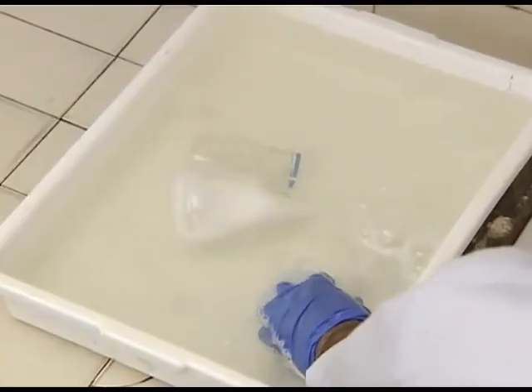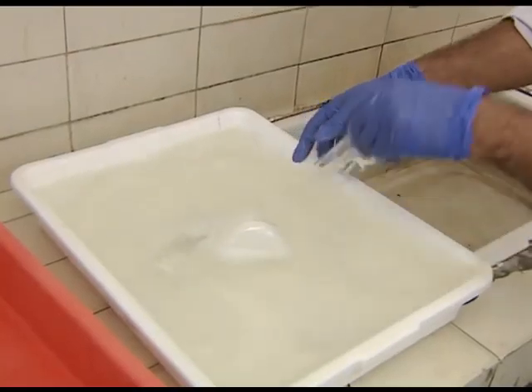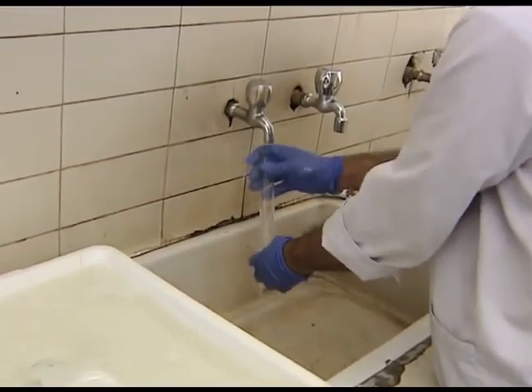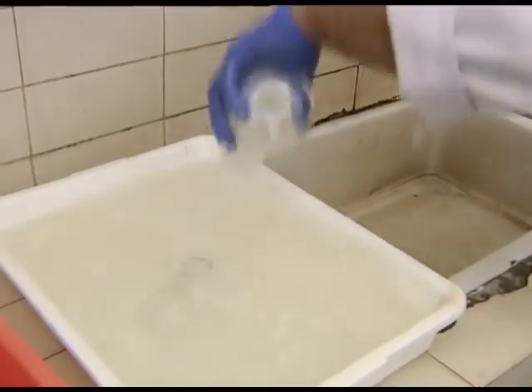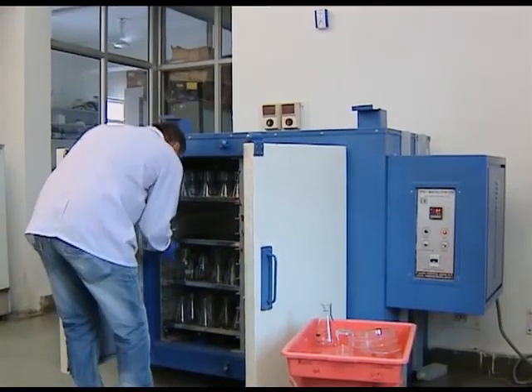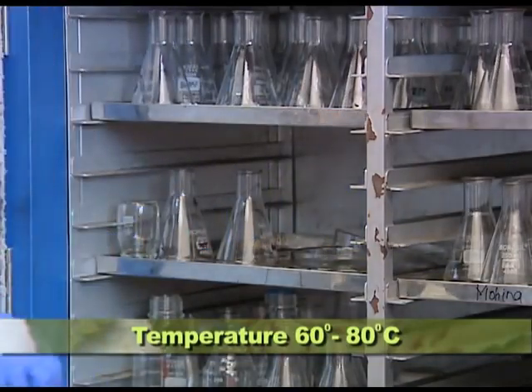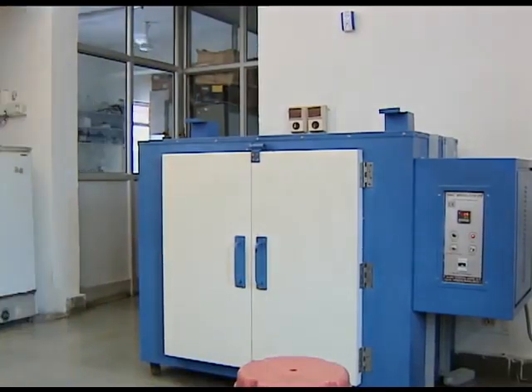The glass and plasticwares are then immersed in another tub full of clean water, and then the detergent is rinsed off. Finally, the glass and plasticwares are washed under running tap water, kept in clean trays and put in an oven maintained at 60 to 80 degrees Celsius for drying. The dried glasswares are now ready for use.